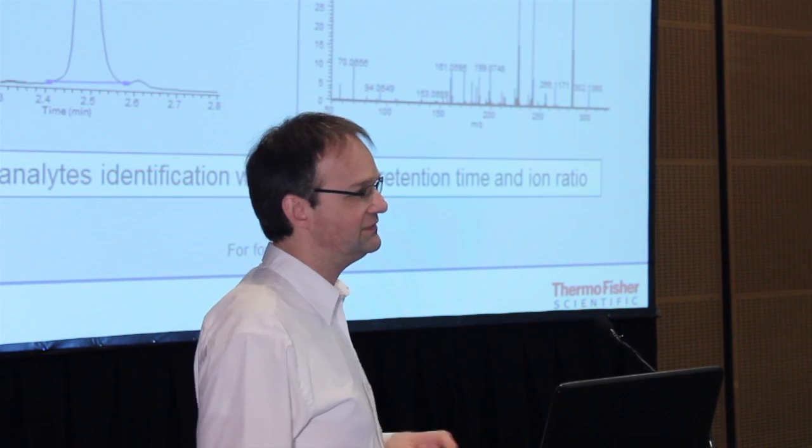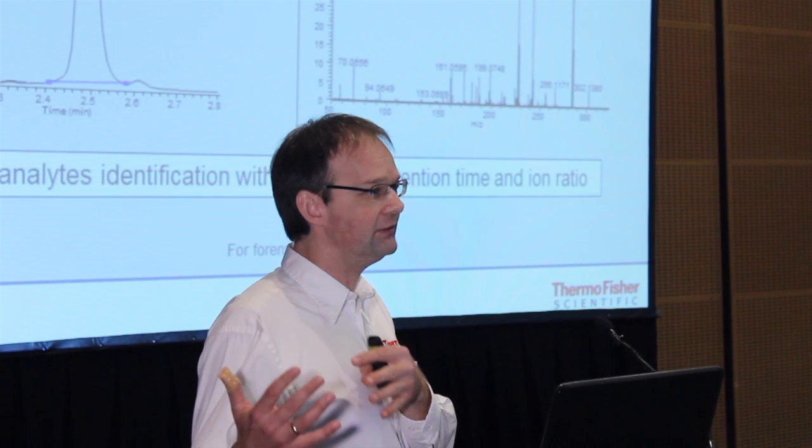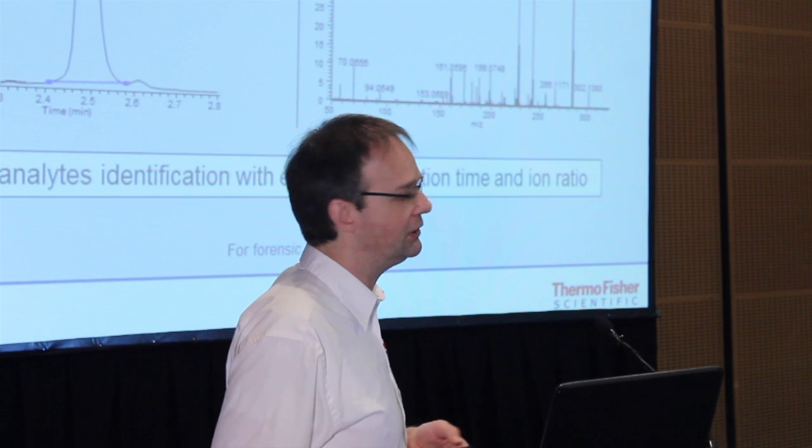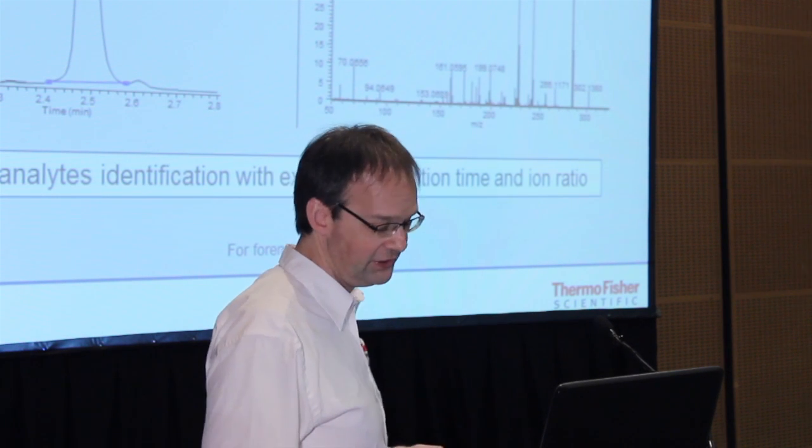And since we are not selecting the fragments in a Q3 like on a triple quad, we always see all fragments. So you even could use more fragments if you want. These are only the most abundant fragments for confirmation here.